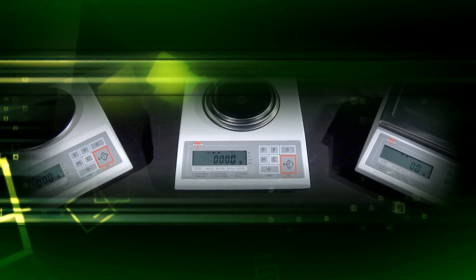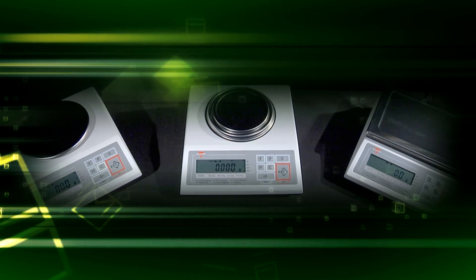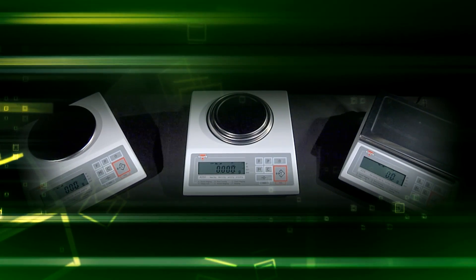The price of the AD series is an outstanding value, guaranteeing an excellent price to performance ratio.